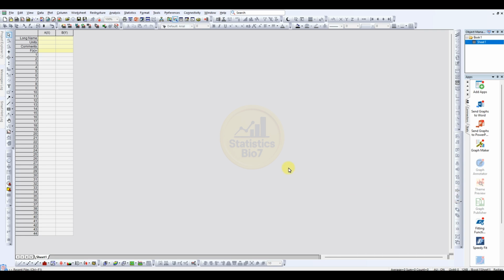Whether you are a student, researcher, scientist, engineer or data analyst, this video will help you understand why OriginPro is one of the most powerful scientific graphing and data analysis software available today. So what is OriginPro?